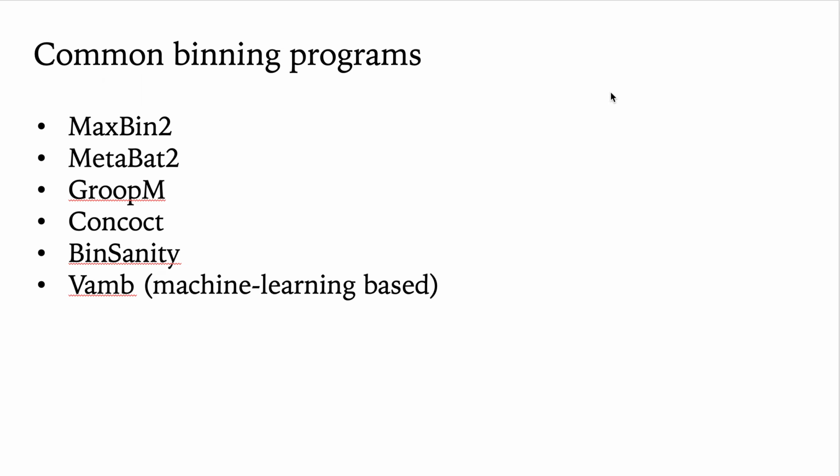And in fact, I would say that their efficiency or their quality will depend on the type of samples you have, the type of coverage in your metagenome. All these things can affect binning efficacy. And so you should really run more than one binning program to get the best results.